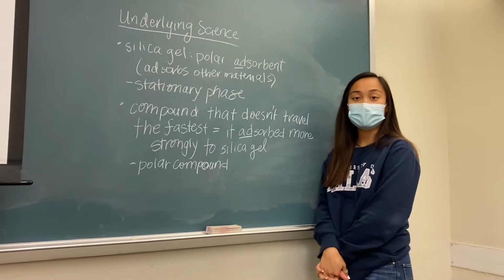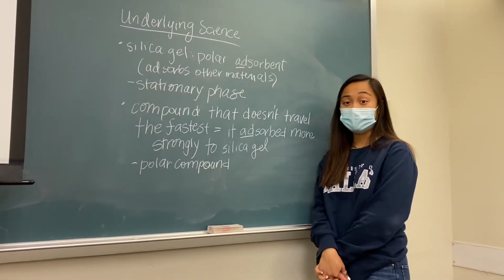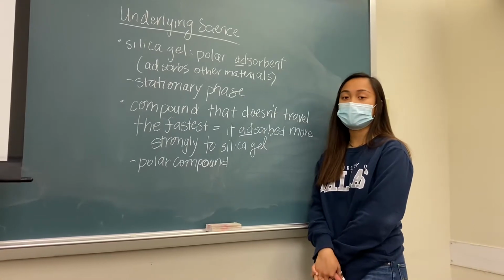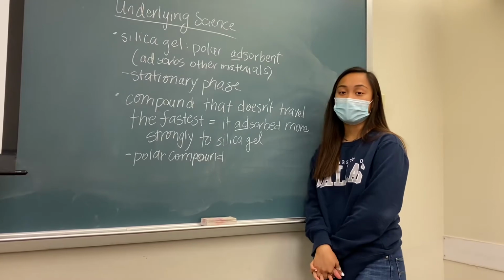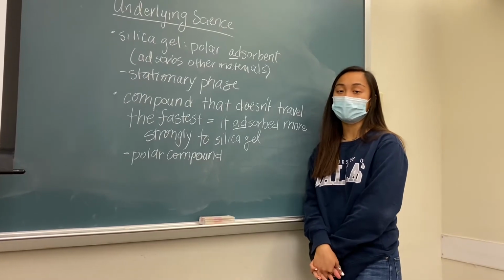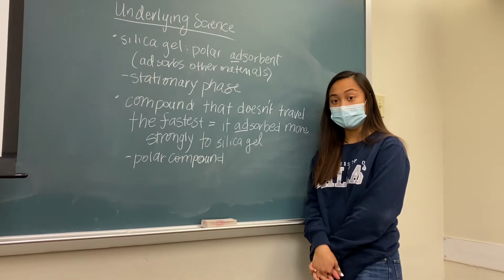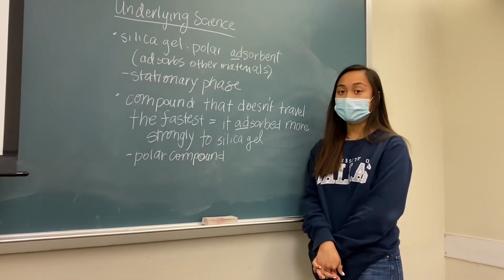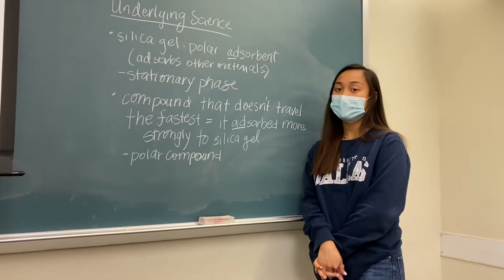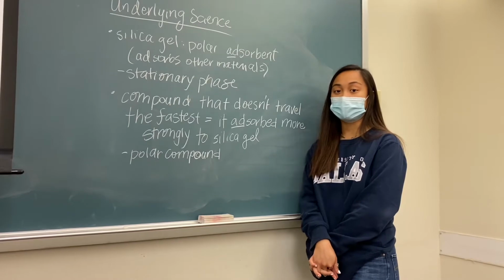So what is the underlying science behind silica column purification? The basic principle of column chromatography is just to adsorb solutes of a solution with the help of the silica, and then further separate the mixture into distinct components. Silica gel is a polar adsorbent, which means it adsorbs other polar materials. It has a high specific surface area, and it is the stationary phase for column chromatography separations.